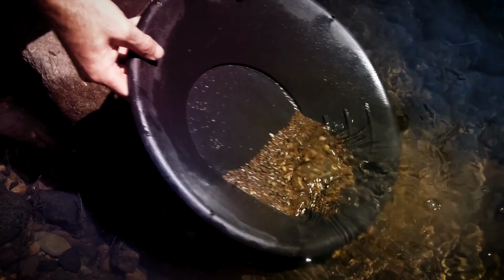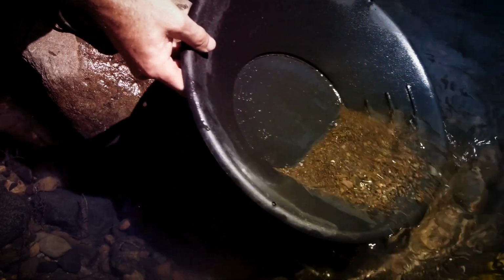Insoluble proteins, on the other hand, are like gold ore trapped underground. You need to dig it out and refine it, which takes more time and effort. So a lot of times when purifying proteins, we want to start out by trying to enhance solubility rather than going through the trouble of refolding insoluble proteins. Some proteins refold nicely, but others, especially enzymes, can lose their activity in the process.